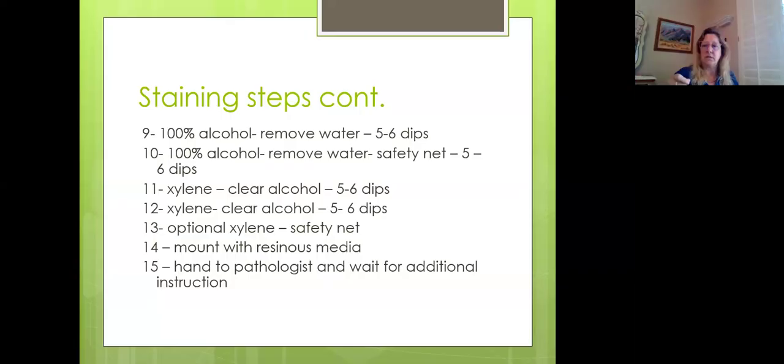You're under a time constraint. So, if there's something that the pathologist can't see through, you can quickly tap it, walk it again, get the excess media off of it, because there's nothing worse than handing a pathologist a slide that's all goopy. So get that excess media off of it, and blang, you hand it to that pathologist.